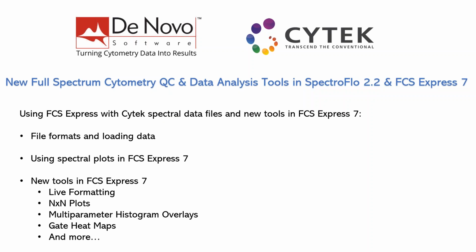But in this section of the webinar, we're first going to cover some of the file formats that are necessary for loading data into FCS Express 7. We're going to be covering how to use spectral plots in FCS Express 7 at a high level, and then we're going to be diving into some of the panel-based data sets that Janelle had presented, looking at that in the context of some of the new tools in FCS Express that can help you perform some quality control on these data sets, as well as comparing the panels that you're creating from this type of analysis.